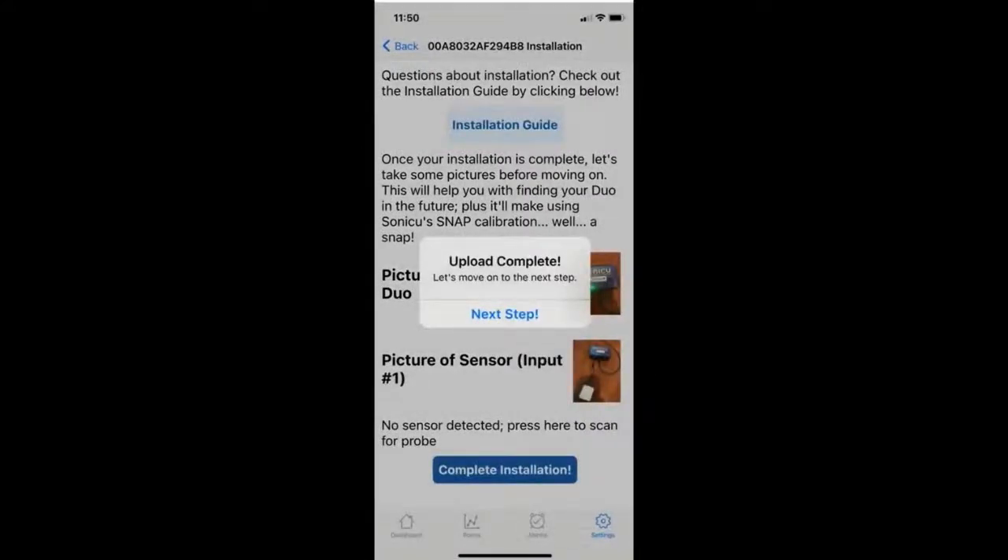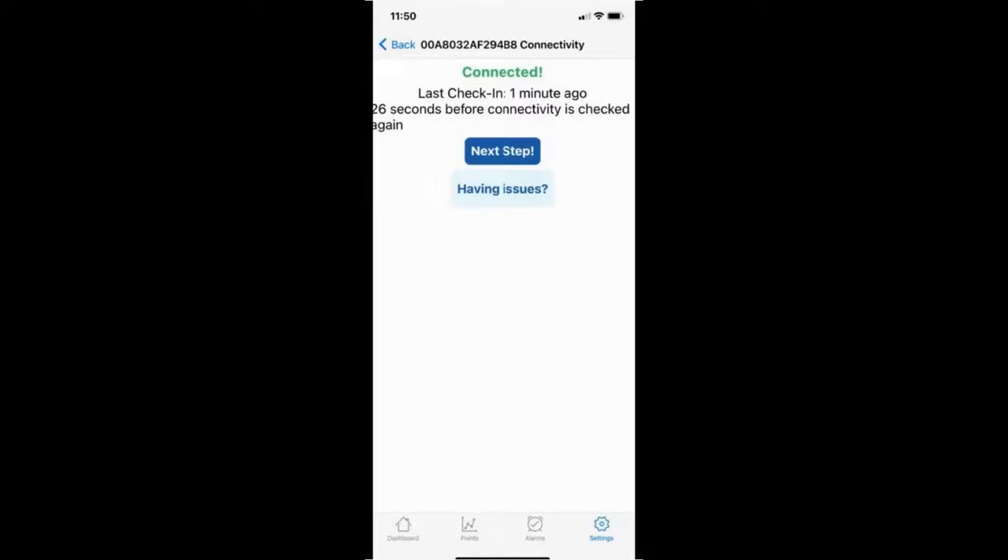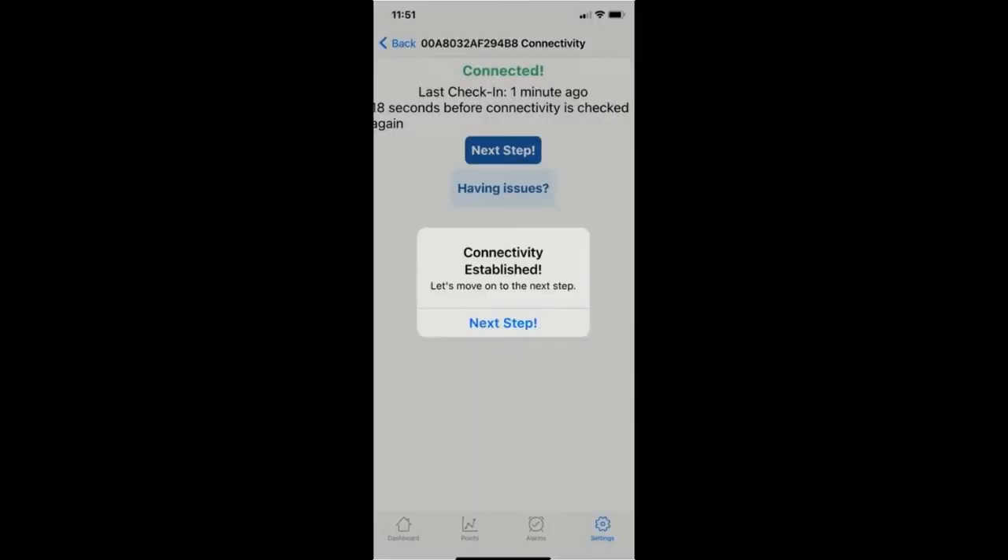The status will turn from red to green, indicating that the device is connected. The last step is completing the setup by naming the points and adding zones. Your Duo meter and point have now been set up and can be seen on the Sonic Cloud dashboard.